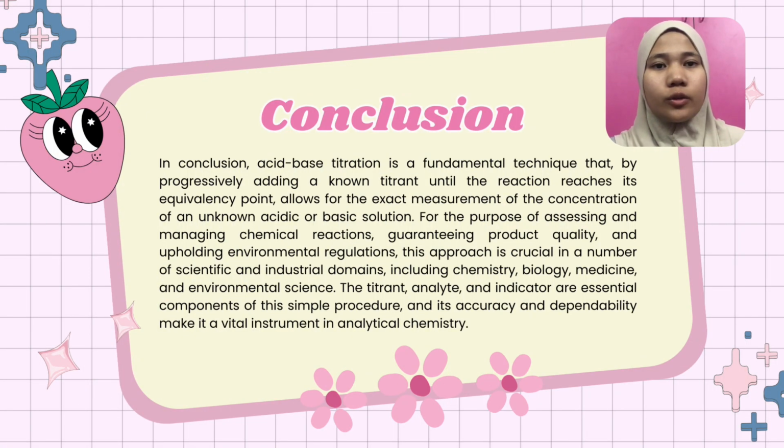So, in conclusion, acid-base titration is a fundamental technique that, by progressively adding a known titrant until the reaction reaches its equivalence point, allows for the exact measurement of the concentration of an unknown acidic or basic solution, for the purpose of assessing and managing chemical reactions, guaranteeing product quality, and upholding environmental regulations.